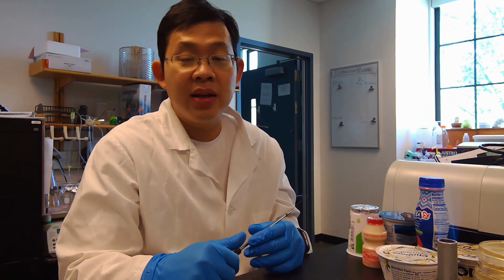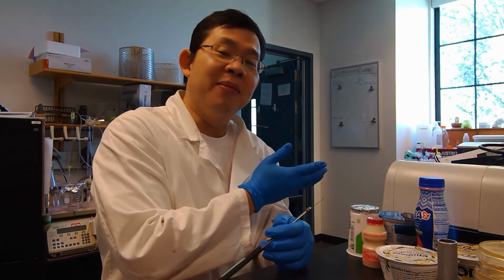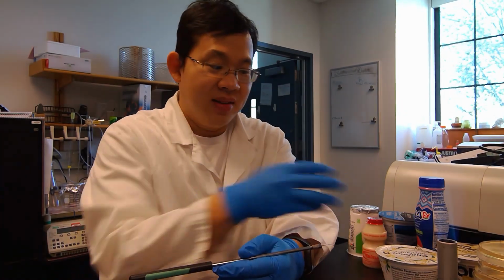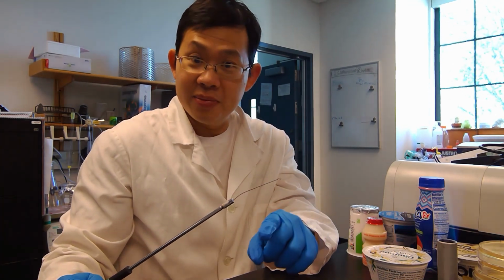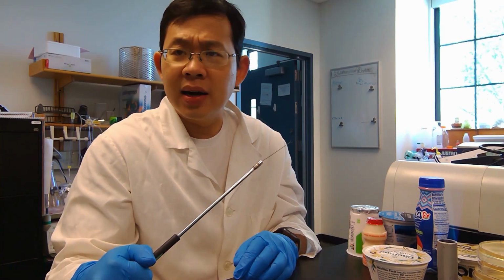Now, when you perform streak isolation, you want to have mastered your aseptic technique already, and this is why in a typical microbiology lab, you learn about aseptic technique, and then once you master that, you perform streak isolation, which is a type of pure culture technique. Before you take your sample, you need to make sure that there are no other bacteria on your loop, because if there is, then you are introducing contamination.